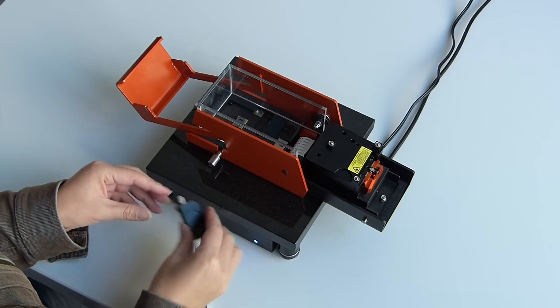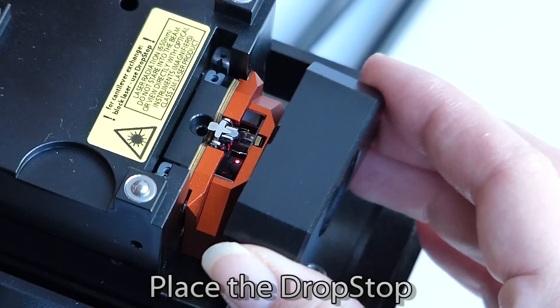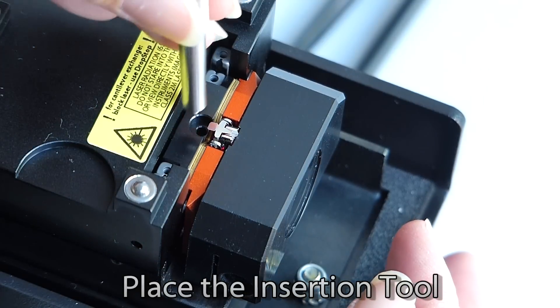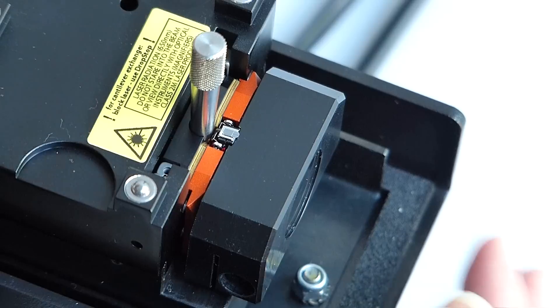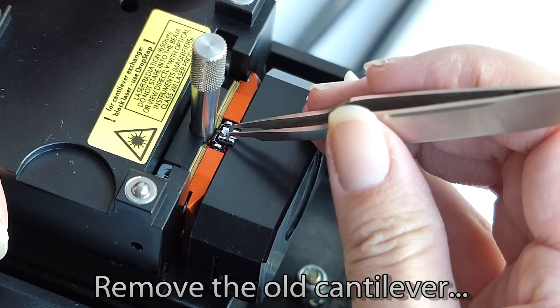We remove the insertion tool from the drop stop and position it onto the scanner. This shields the opening from any cantilevers that might be dropped into the scanner cavity. The insertion tool is then used to open the clamping spring. The old probe can be removed using tweezers.